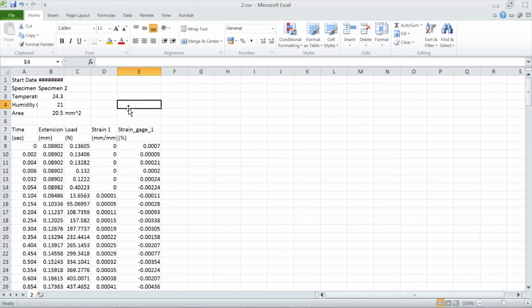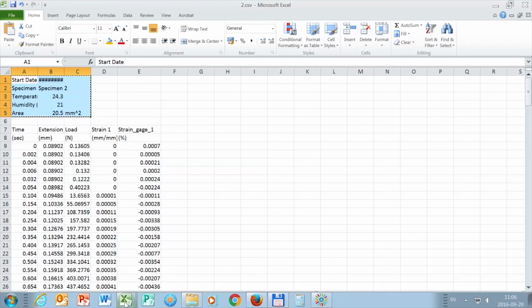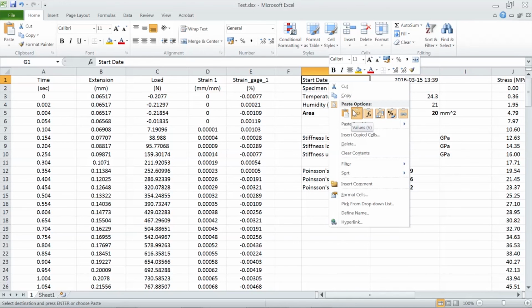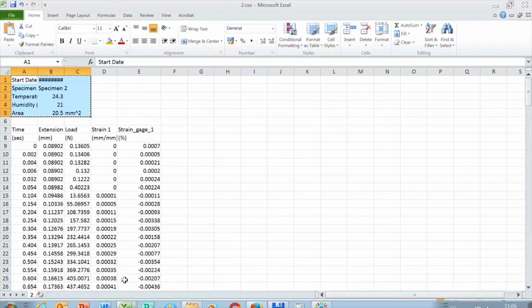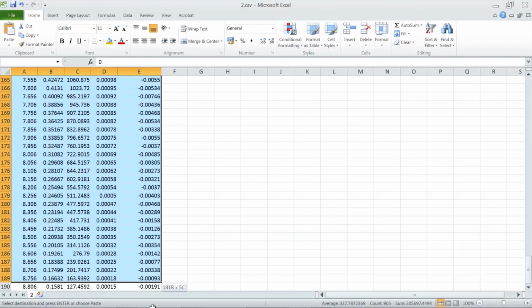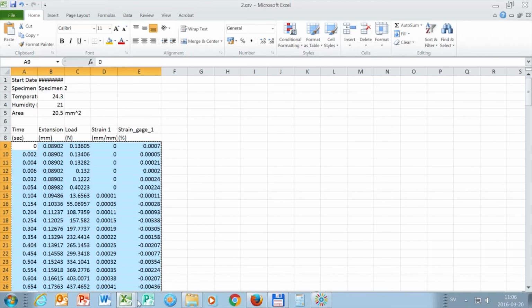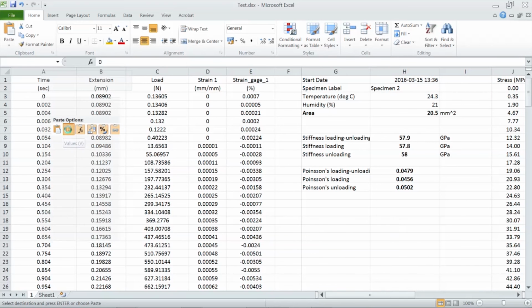So what we're going to do is take these results and copy them into the data sheet which we have processed here. First I copy a header. See, I copy only values. Now these are different values. And I will copy all values from columns in the same way. I go back to the data sheet here, and I select all the data. And I paste them. Because we have exactly the same columns, I can just go to the first one, and you see I paste only values.